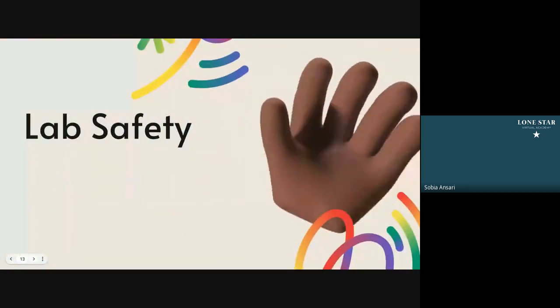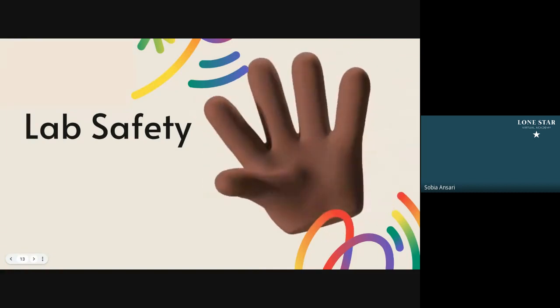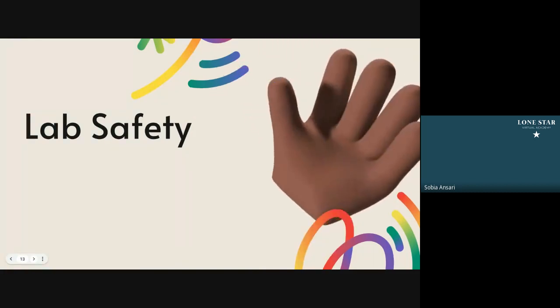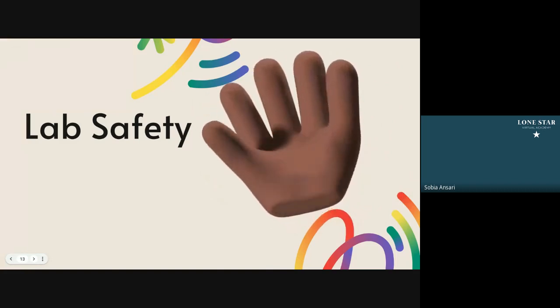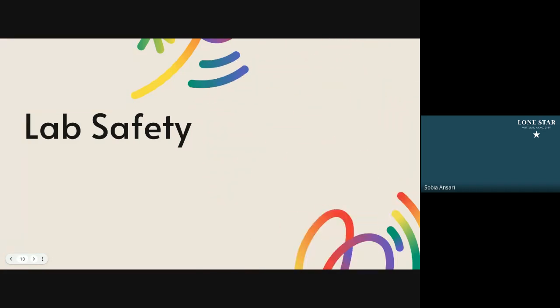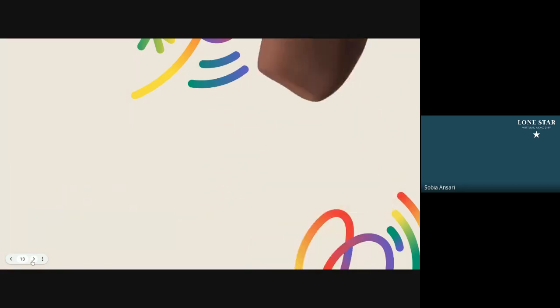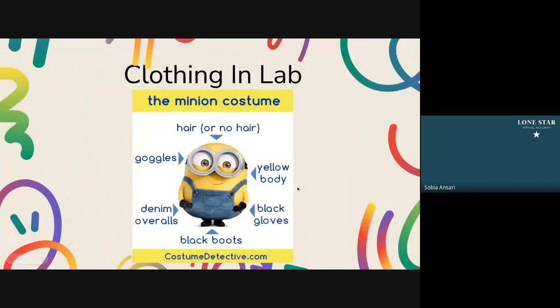All right, lab safety. So in your lessons, it goes into a lot of details about what lab safety looks like. I'm going to summarize all those details in this recorded video into a few slides. First things first, clothing in a lab.